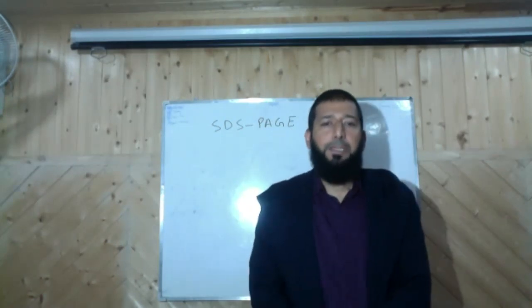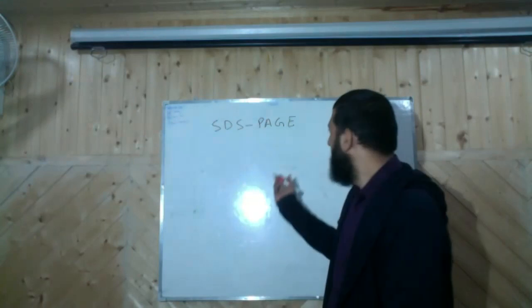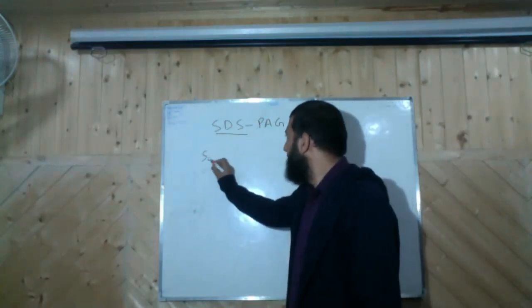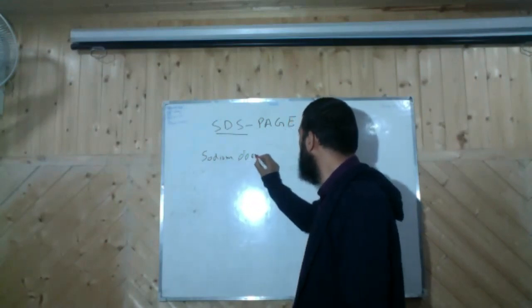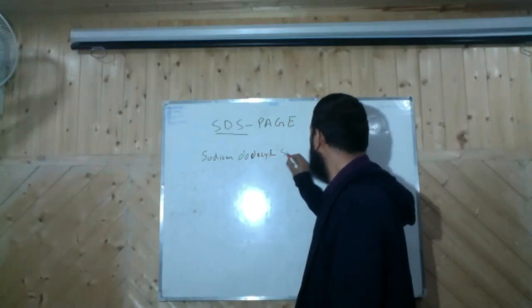Okay, so SDS stands for sodium dodecyl sulfate.